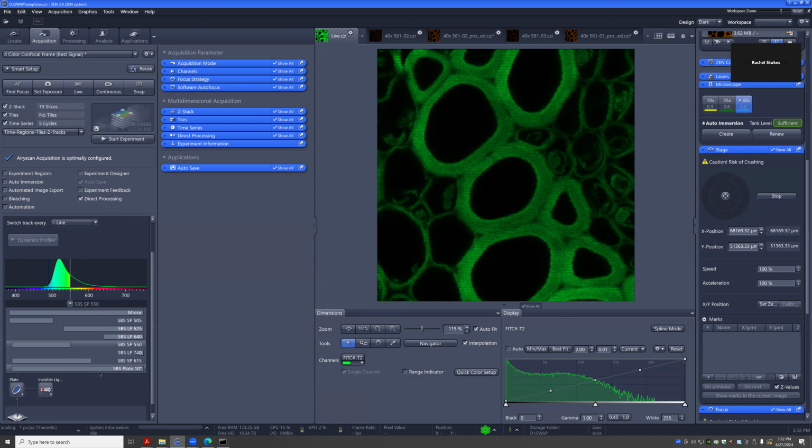If you want to get a little more signal, for example, in this, you can try out the plate. It just means that if you have plate and this laser line, say it activates some other fluorophore, you wouldn't be able to distinguish, right? It would bleed through. So if you want to block off the reds, this one would block off the red emission right here. So that's one thing to play around with.